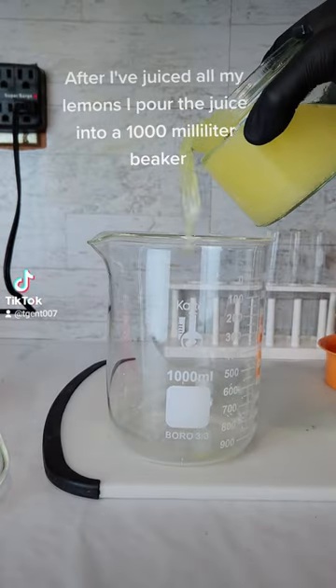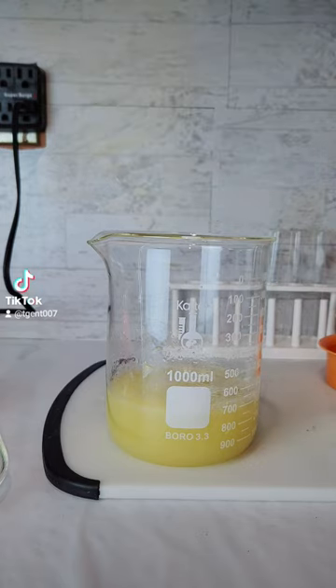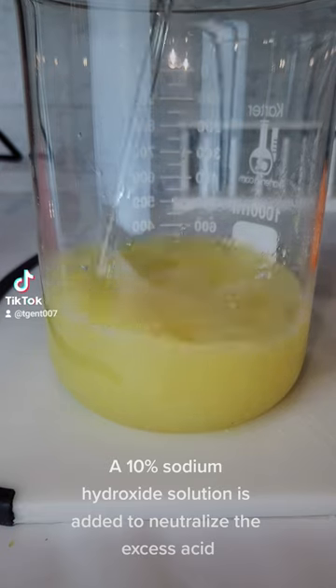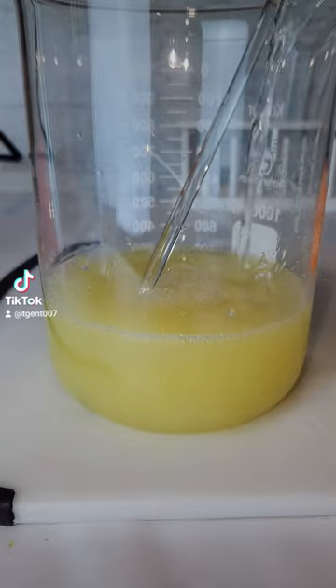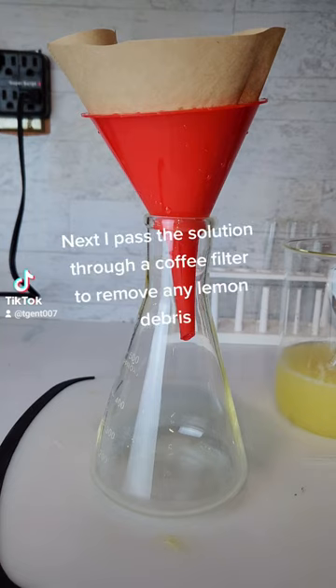After I've juiced all my lemons, I pour the juice into a 1,000 ml beaker. A 10% sodium hydroxide solution is added to neutralize the excess acid.